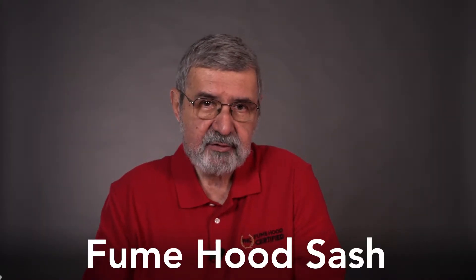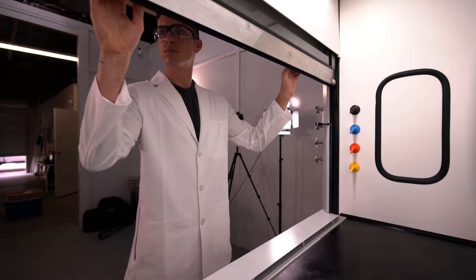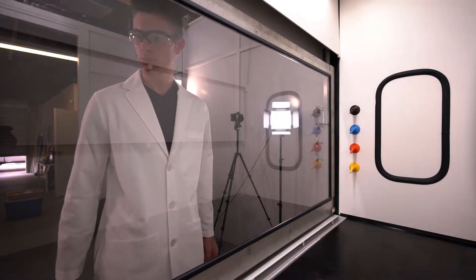From the user's point of view, it's all about the sash. The sash is the interface between the fume hood and the user — it's the primary feature that provides you with protection. The sash is a protective barrier between you and the bad and dangerous stuff. Managing the sash is largely common sense, and the lower the sash position, the better.